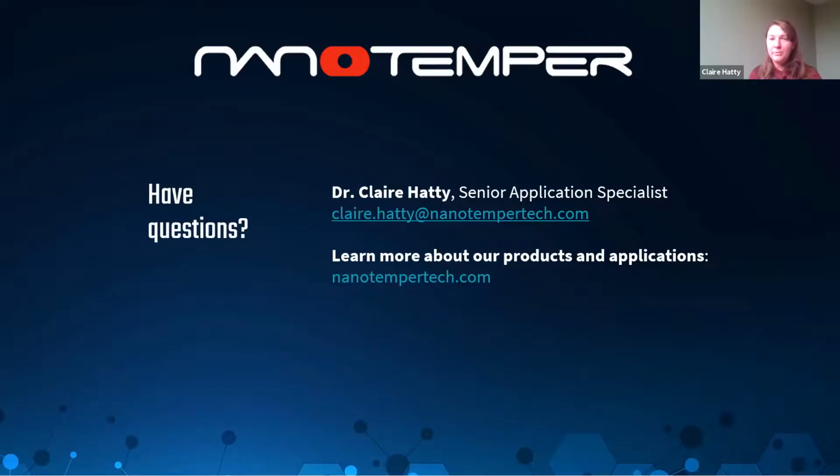So the GFP is actually in the blue channel. With MST, your two most common filter set combinations are red and blue. But whatever you do, always have the red, because our dyes are all optimized and made for the red detector. They're the most sensitive, so we have the least interference in the red range, but we also appreciate that a lot of people use things like GFP, which is measured in the blue channel. So that is an option as well.